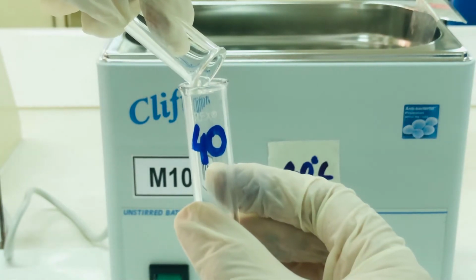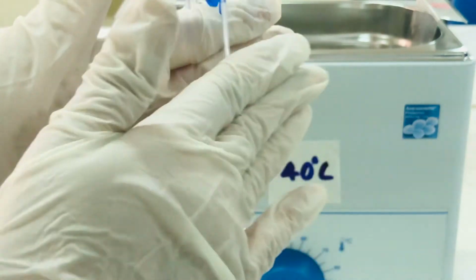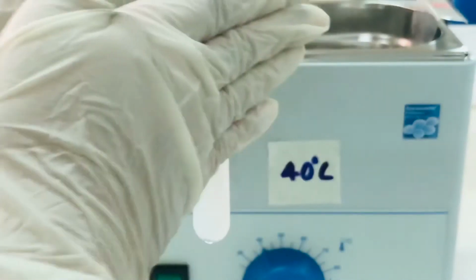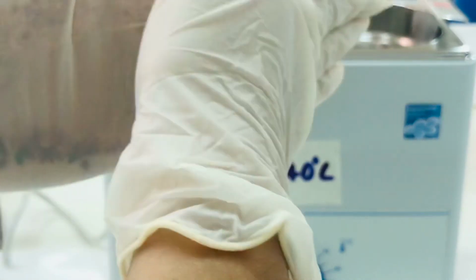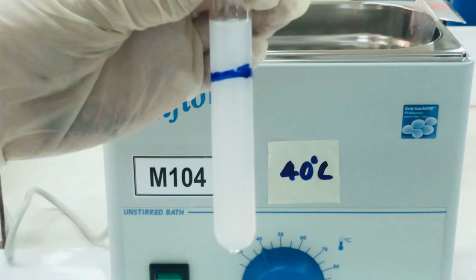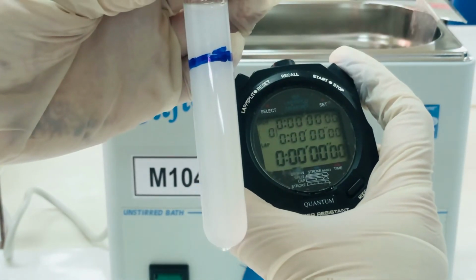As soon as we add both the samples, just swirl and mix it, and start the stopwatch.